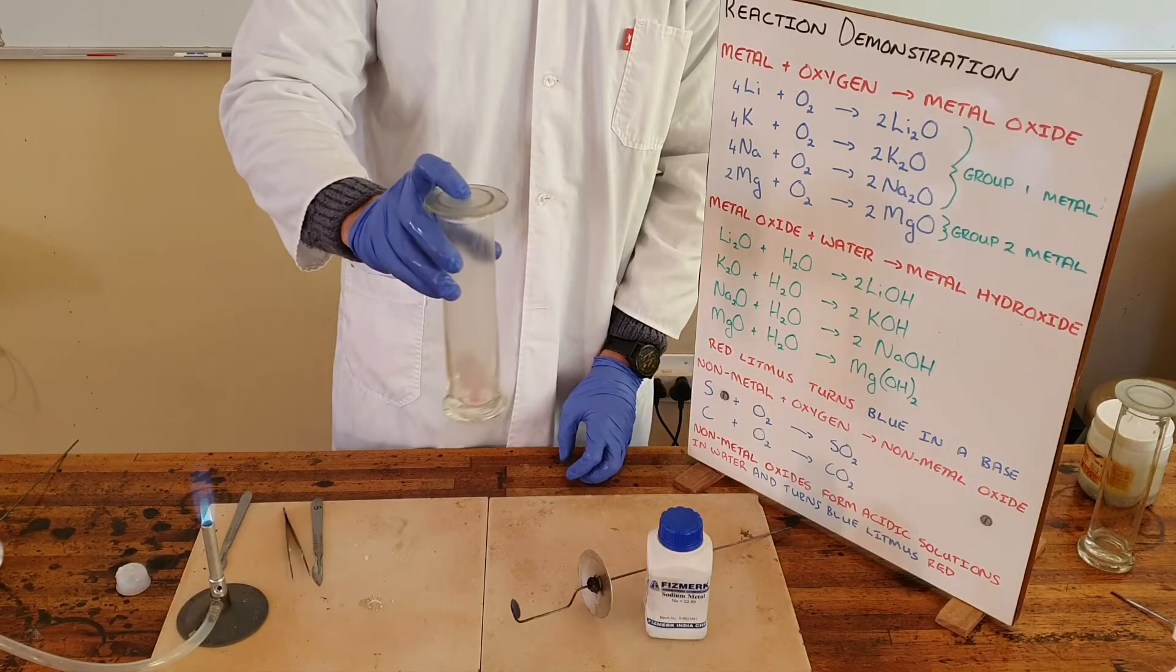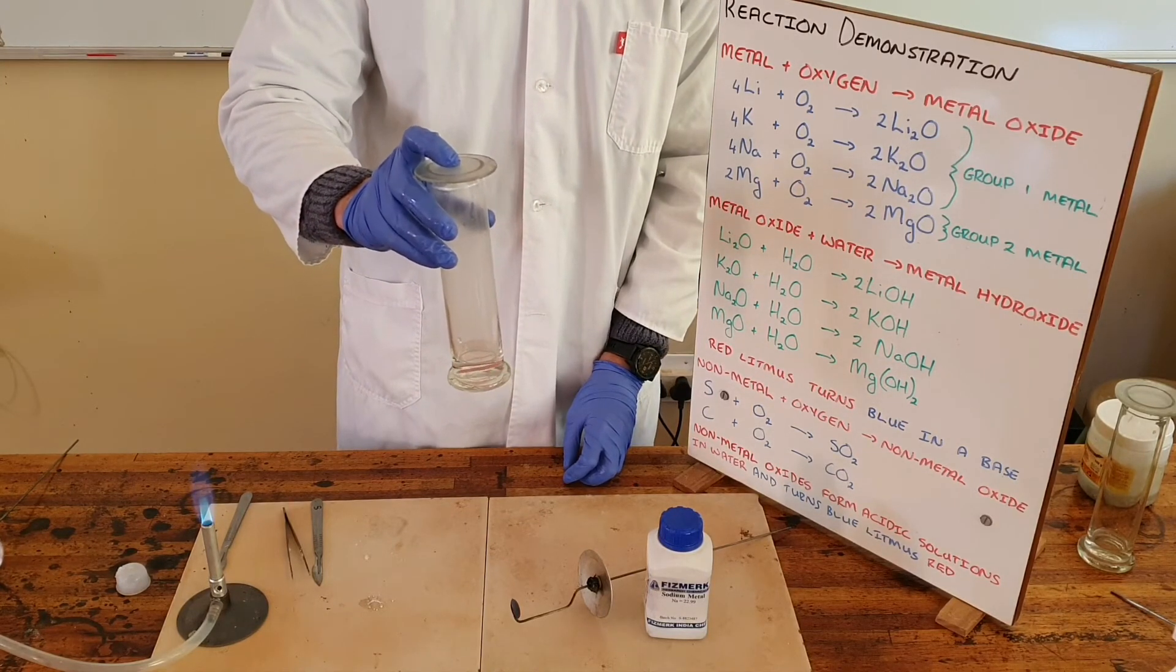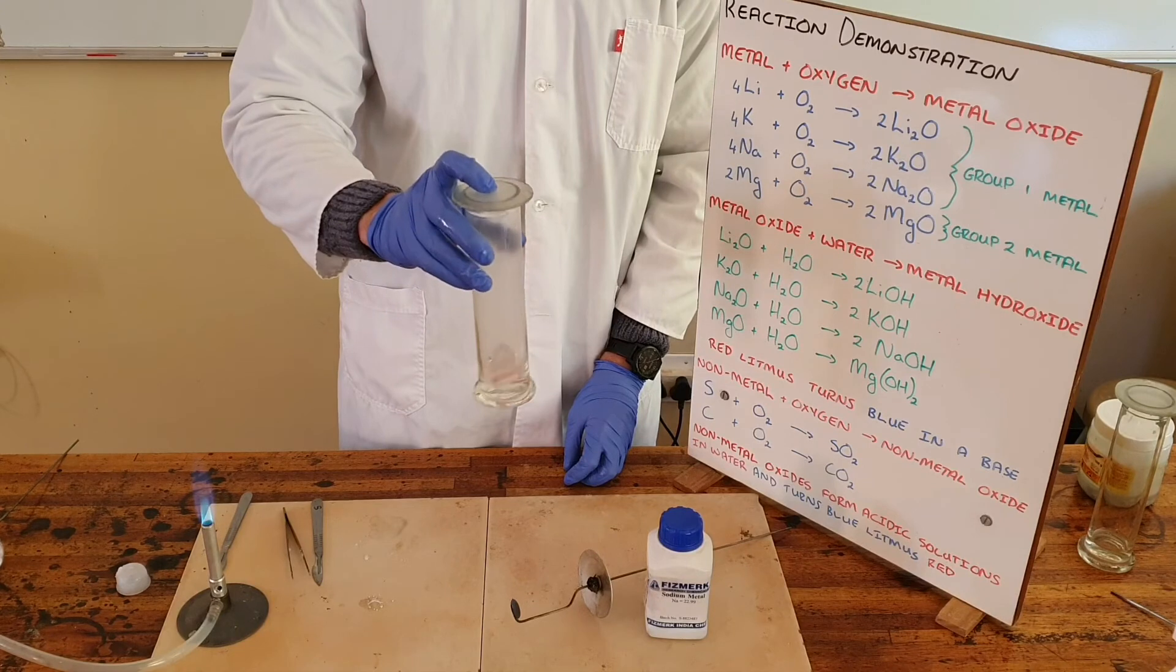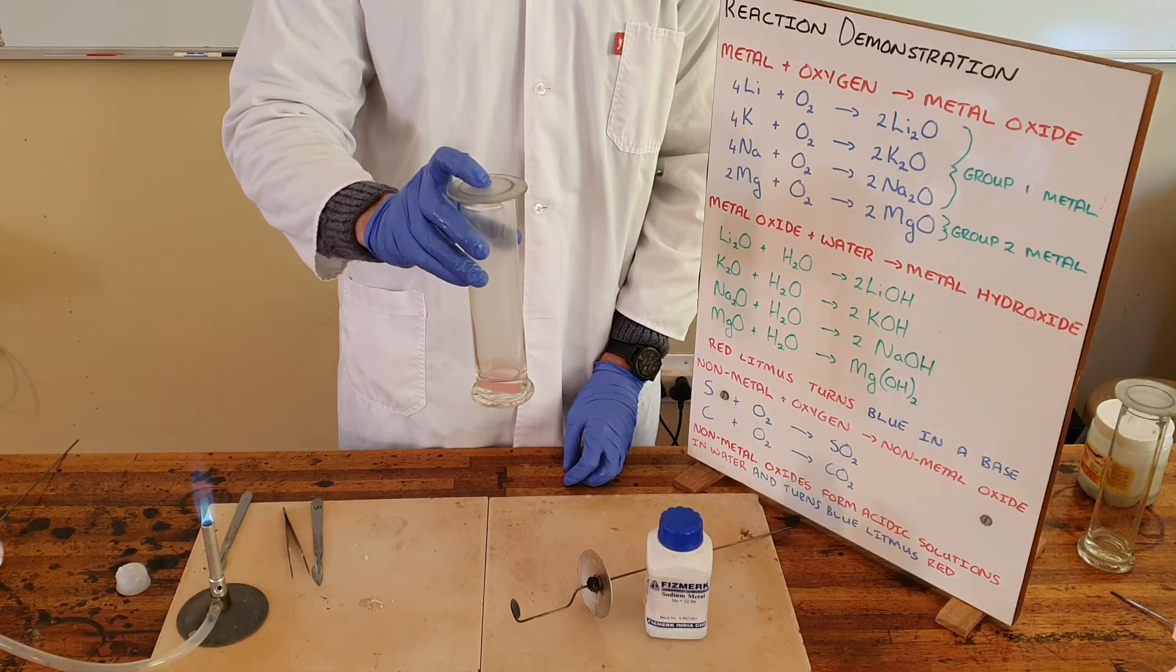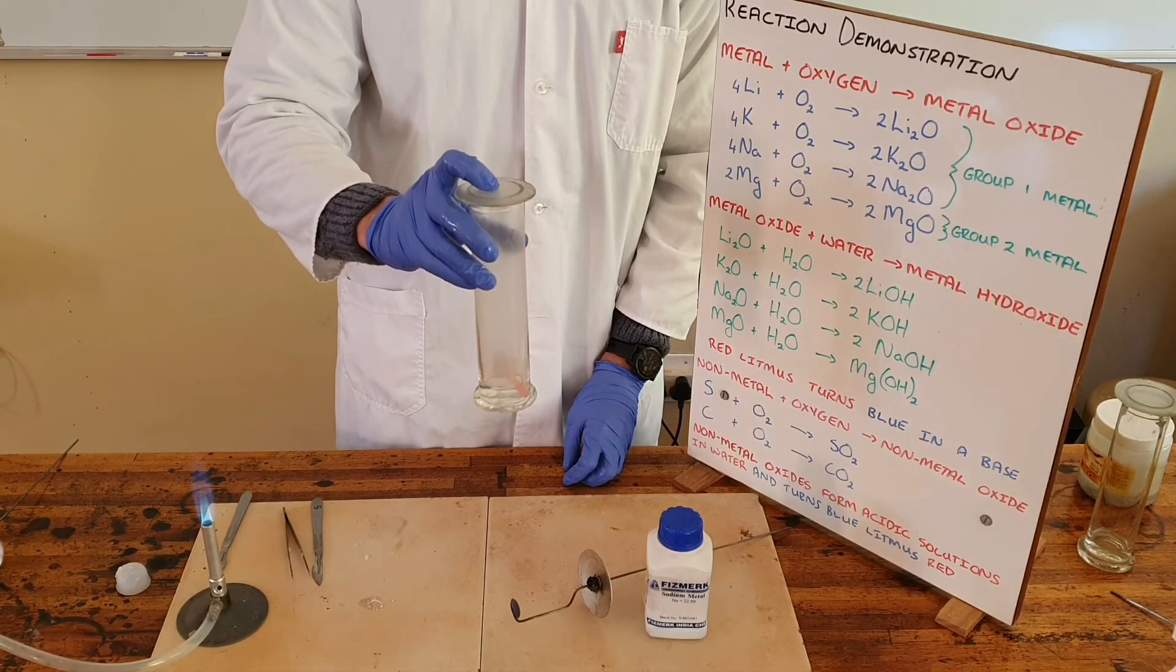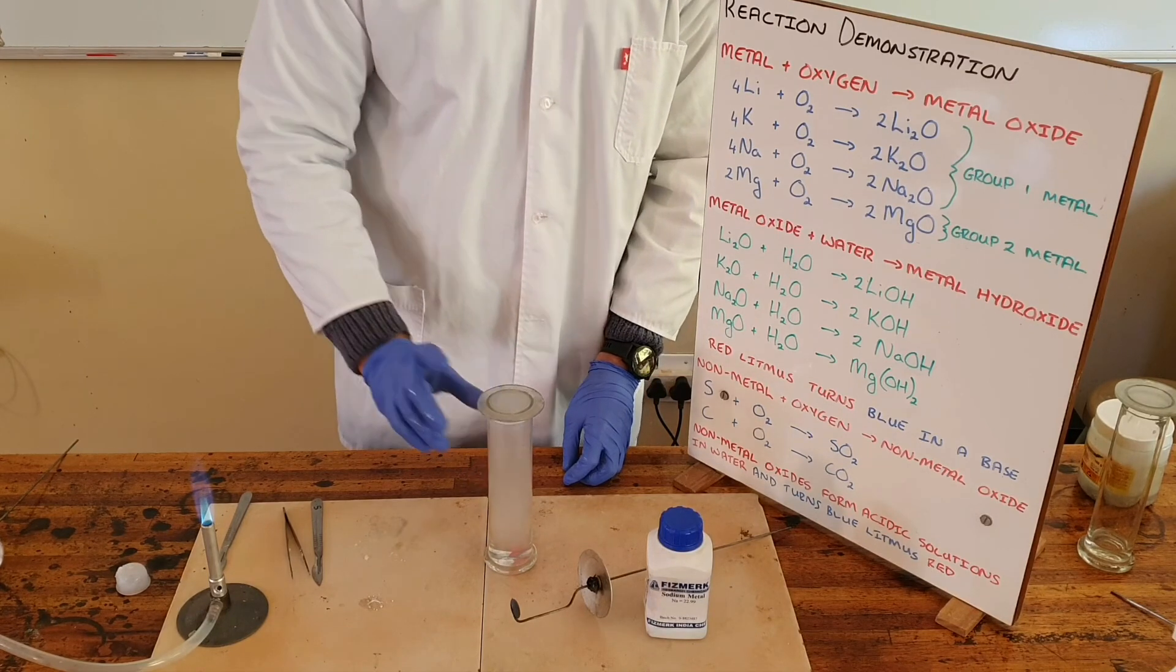Here you can see it's a slightly slower process than the lithium, but we can see that the red litmus does start to turn blue as the solution becomes more basic.